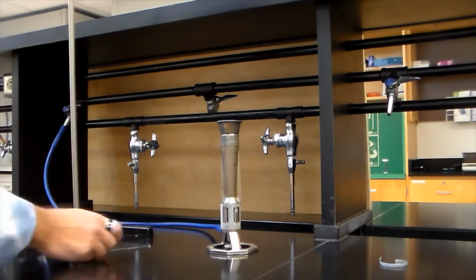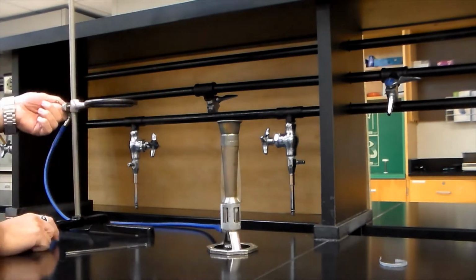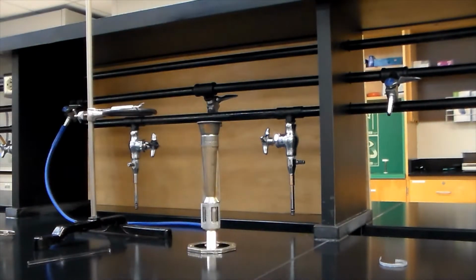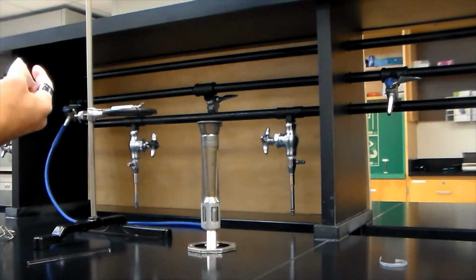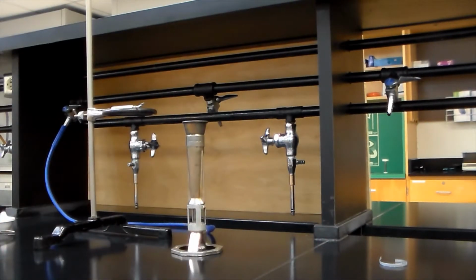The empirical formula of a compound gives the simplest whole number ratio of the atoms present in the molecule. Obtain a crucible and a crucible lid. Check them for hairline cracks or stress fractures. Do not use the crucible or the lid if they are damaged. Rinse the crucible and lid with DI water and dry them with a paper towel.